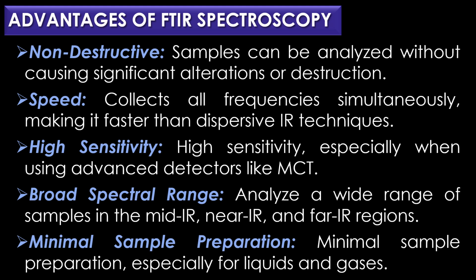The fourth advantage is broader spectral range. FTIR can analyze a wide range of samples in the mid-IR, near-IR, and far-IR regions. The fifth and final advantage is minimal sample preparation. FTIR often requires minimal sample preparation, especially for liquids and gases.